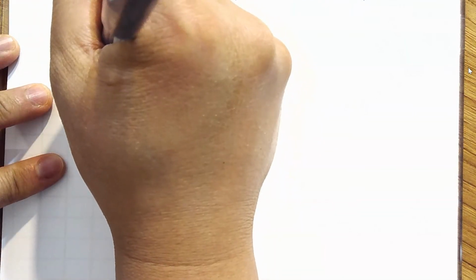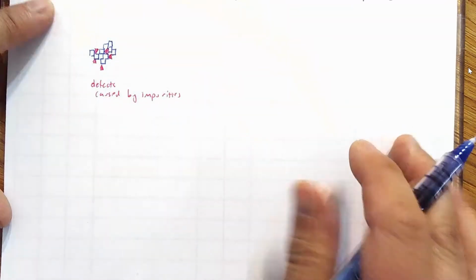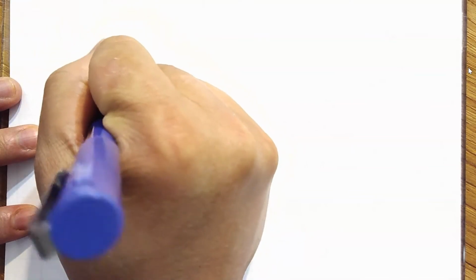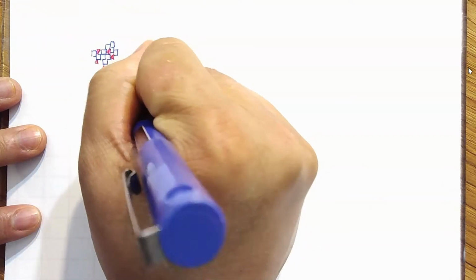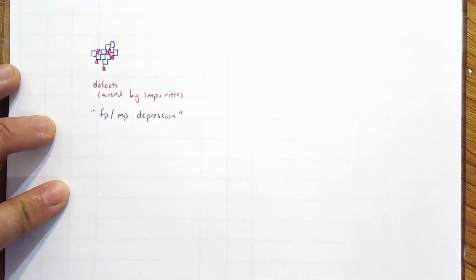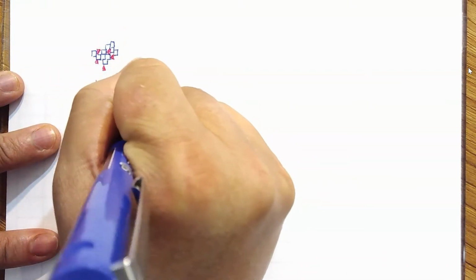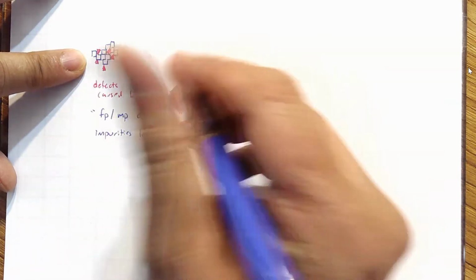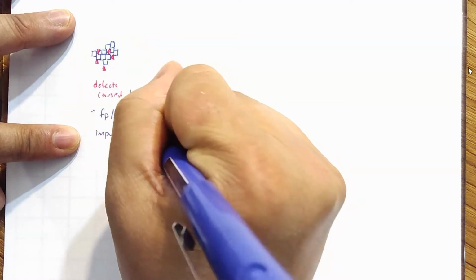And then obviously from those pictures, we have also a lot of impurities coating the solid, coating the crystals. Now you understand from general chemistry, you've heard of freezing point, same as melting point, depression. So impurities lower the melting point, typically, because the crystal structure is not as strong. The intermolecular forces are not as ordered. So impurities lower the melting point.